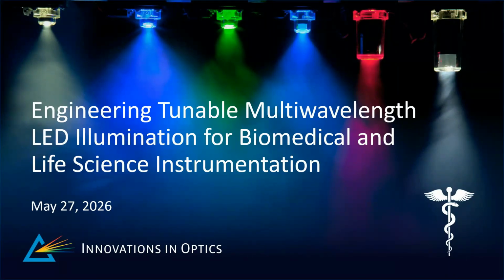Over the last decades, biomedical imaging has progressed from simple visualization toward increasingly sophisticated methods for detecting, measuring, and analyzing biological information. Whether we're performing fluorescence imaging, PCR analysis, endoscopy, microscopy, or multispectral imaging, the quality of the illumination is key. It determines the quality of the information we can extract.